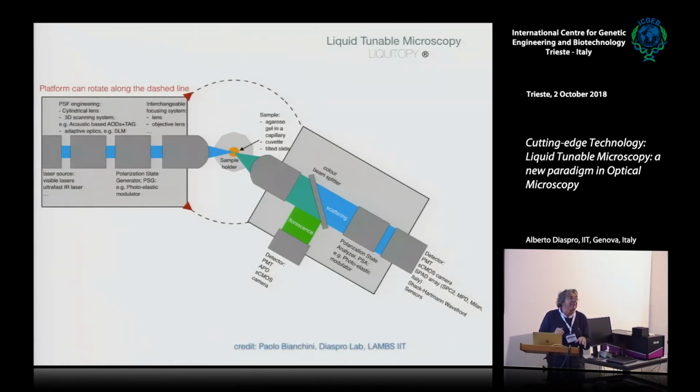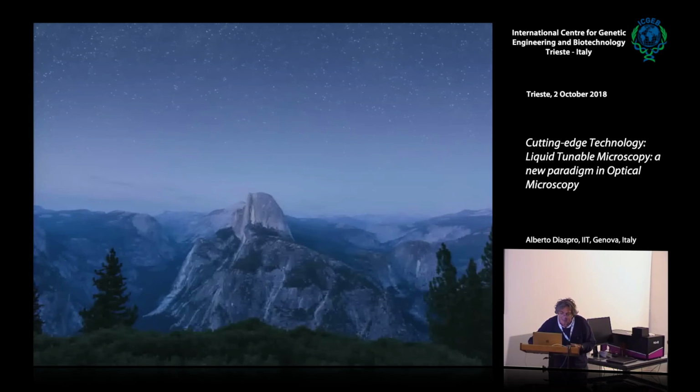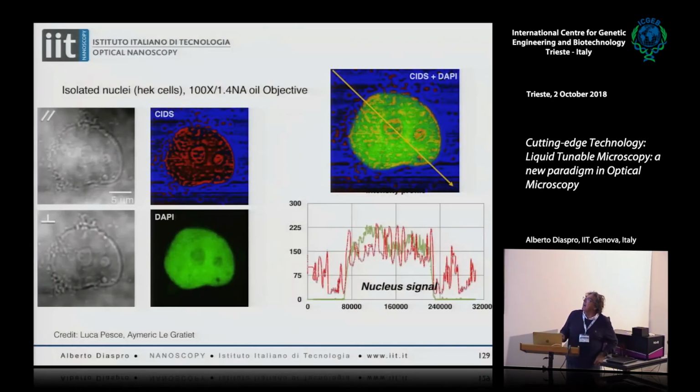And Marco and Simon Luca are very scared because I asked them to be part of this, inserting everything in the machine. And now I skip the part related to only this part, and I show you only one piece of data about fluorescence and Muller matrix. These are very preliminary results we got. So we decided to perform imaging using Muller matrix for a sample that was also filled with fluorescent molecules.